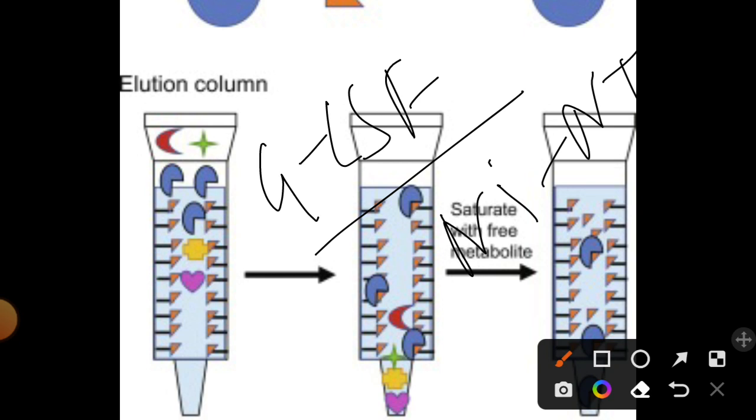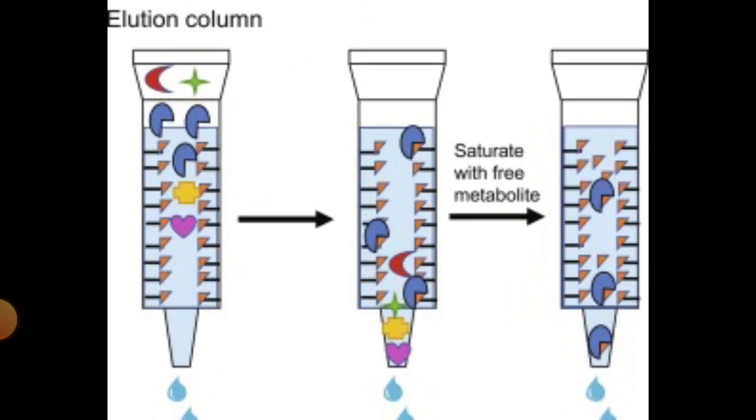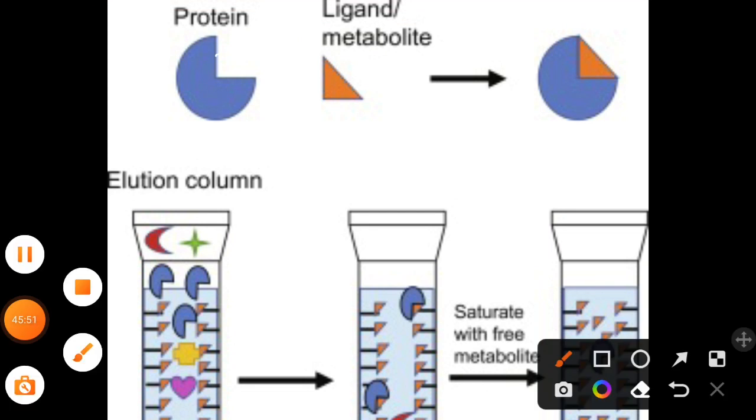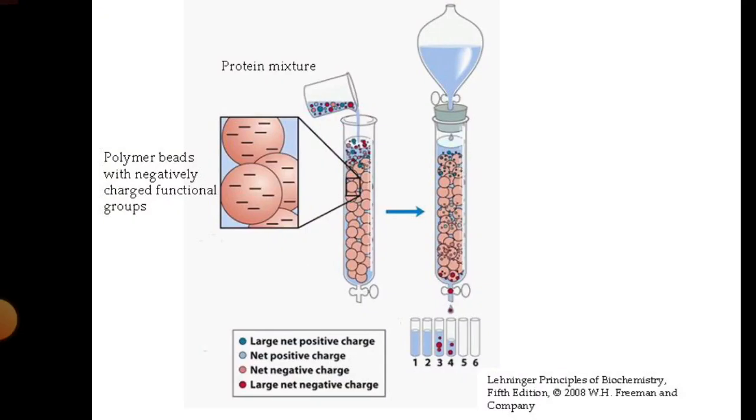Along with that, in genetic engineering, in molecular biology techniques, and in other important pharmaceutical techniques, we are using this affinity chromatography. So today we have learned about affinity chromatography, which is nothing but an interaction of protein and ligand. It helps you to separate at high sensitivity, but it has disadvantages: the ligand can be leaked and it is also very costly.